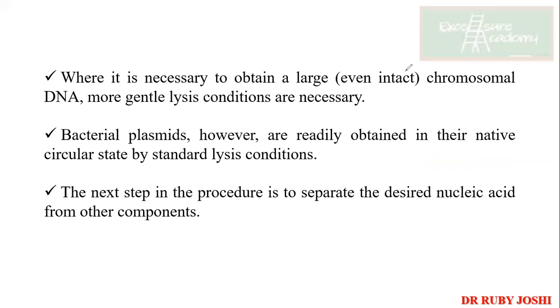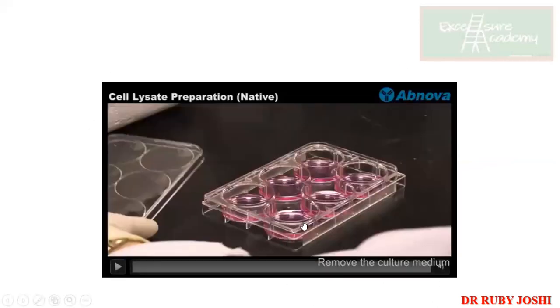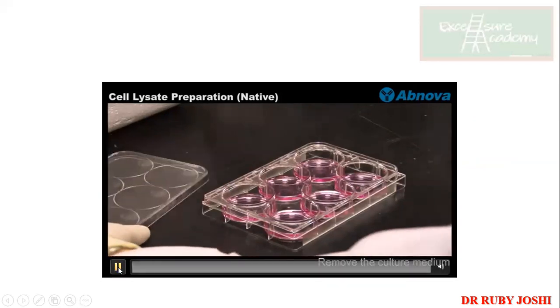Yes, ma'am. Okay. So this is just a video to show how animal cells are used for disruption and to get the lysate. When you say lysate, it means you have just disrupted the animal cell membrane.